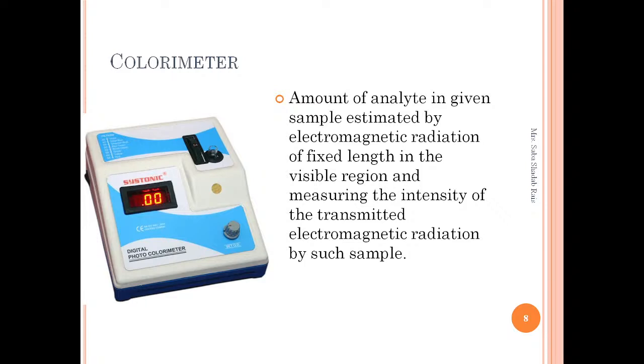So when you keep it in the visible region and measure the intensity of the transmitted electromagnetic radiation through such a sample, whatever light has been absorbed, that much analyte is present in the sample. So basically we can say that we can use this particular instrument to find out the concentration.